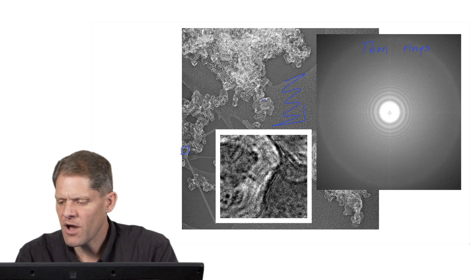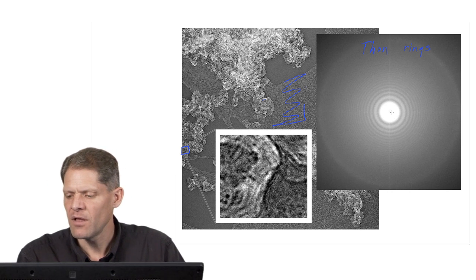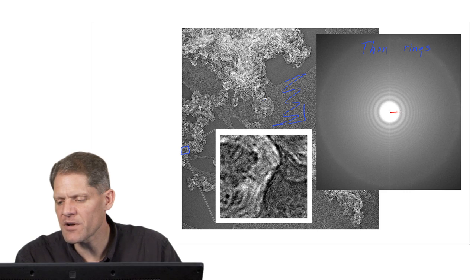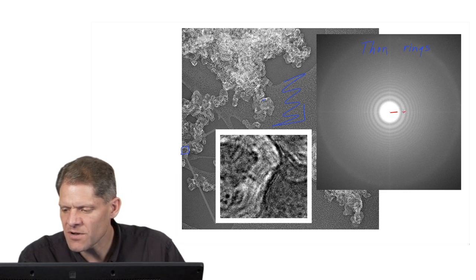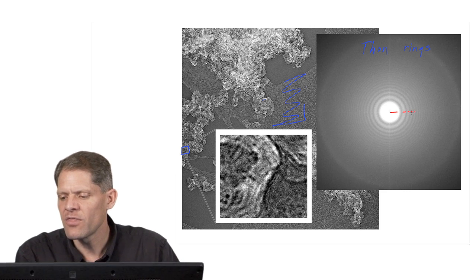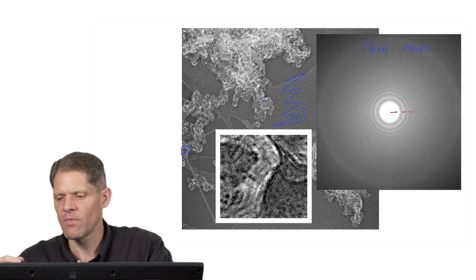And so these are Thon rings, and what they reveal is that there's a lot of power, a lot of signal transmitted into this image at low frequencies here, and then there's a minimum here where the amplitude of the signal is very low. And then there's another band where the amplitude of the signal rises and gets high again, and then another region where there's no signal, and then another region where there is strong signal, etc. And so you have these rings of alternating presence of signal, absence of signal.